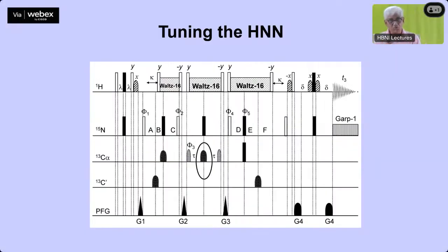Now those were when the glycines are there. Then we can create some other checkpoints by designing the pulse sequence in an appropriate manner, modifying the pulse sequence in a slightly different manner. The crucial thing to modify here is this particular pulse here. This is the so-called selective pulse. This is a 180-degree pulse applied only to the C betas. Sorry, C betas, not C alphas.